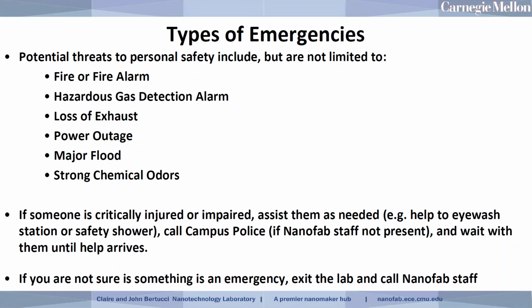So again, the last bullet point is just reinforcing what I already said. If you're not sure if something's an emergency or if it's normal, or if you're hearing an alarm and you're not sure if it's an emergency alarm or just a tool finishing a run, always feel free to contact the staff. Exit the lab if it's a potentially dangerous situation, and then contact the staff, because we're in there almost every day. We know what's being worked on.